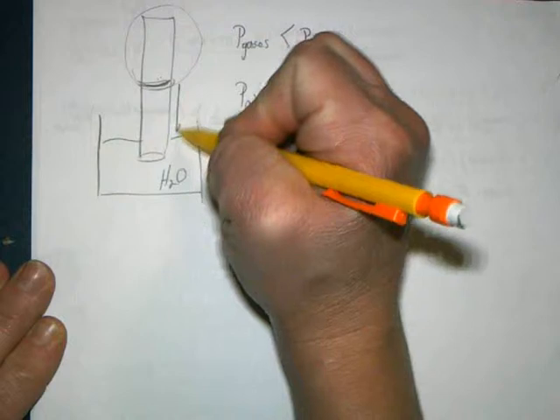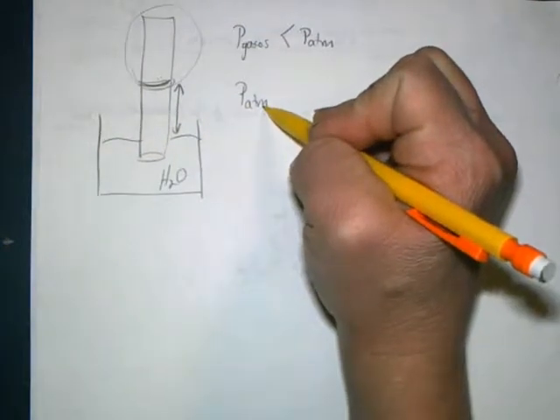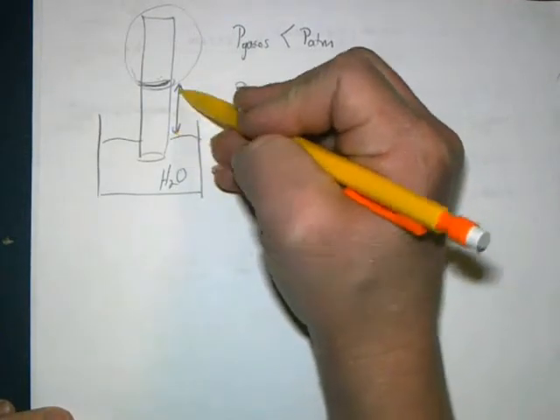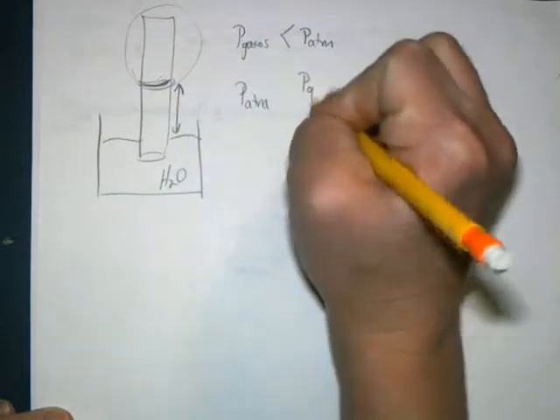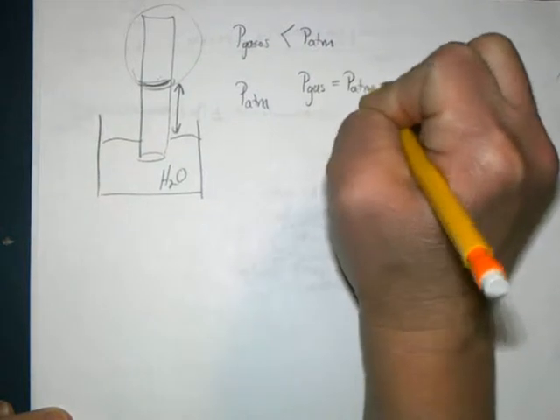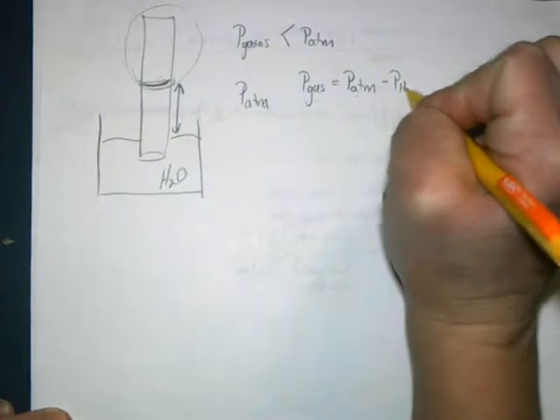All that we need to do, because our barometer reads the strength at being able to combat gravity, we can look at the height difference of the inside and the outside. All right. So the pressure of whatever gas, we're going to start by comparing it to the pressure of the atmosphere. We know because we're collecting over water, we'll have water vapor there.